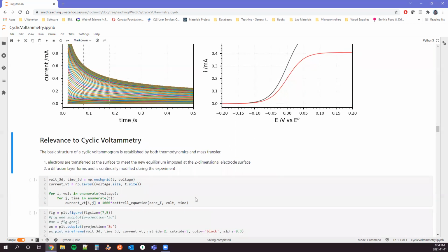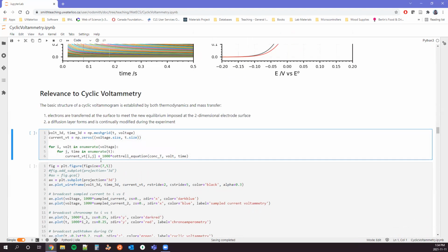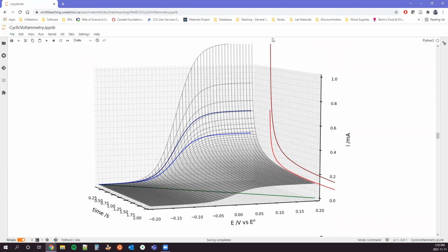How is this all relevant to cyclic voltammetry? The key with cyclic voltammetry, as I mentioned at the beginning, is that we're constantly perturbing the system, right? We're going to change the voltage and therefore the equilibrium continually as a function of time. And so we can turn this into a three-dimensional plot, where we have time, we have voltage, and we have current.